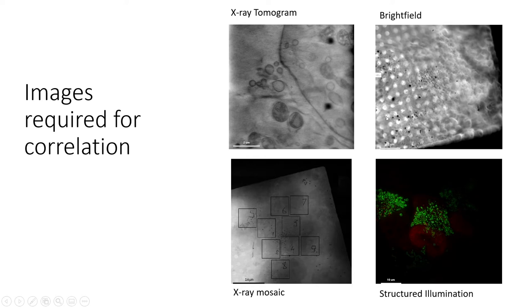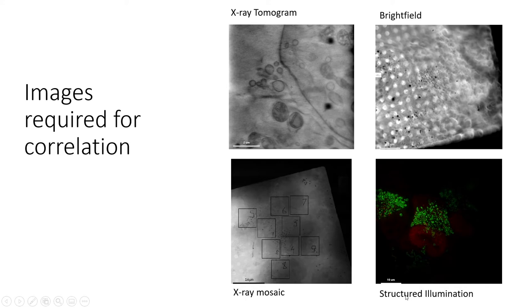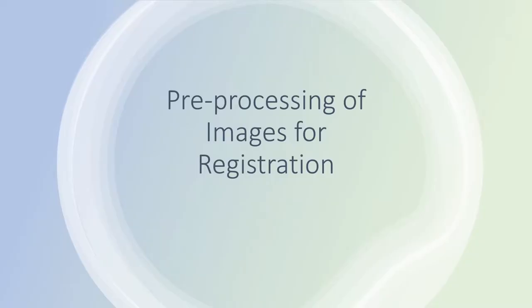Then there's also the Brightfield Z-Stack that's taken on the SIM microscope. And then finally the Structured Illumination Reconstruction Z-Stack. If you need to do chromatic shift correction on this, have a look at the extra section in this video. Inside the protocol paper there's also more information if you need to do any stage shift correction as well. That's all done using EC Clem.